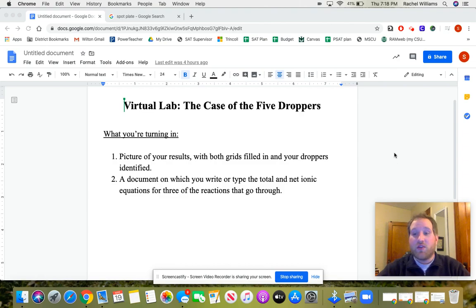Everyone. In this video, I'm going to run through your virtual lab, the case of the 5 droppers. So this is a precipitate lab. We're actually planning on running one of these this upcoming week, so it kind of works out that we have this option online. A precipitate lab is basically when you take a bunch of solutions and you mix them all together in every possible combination.